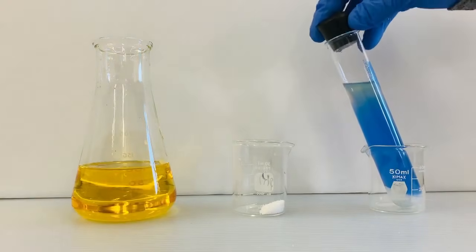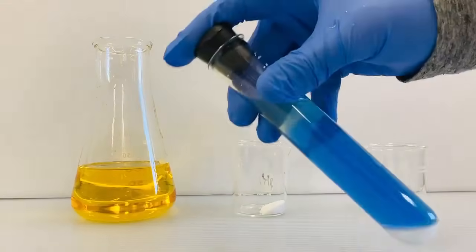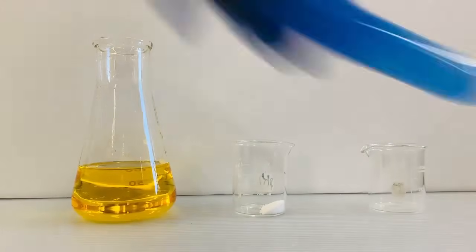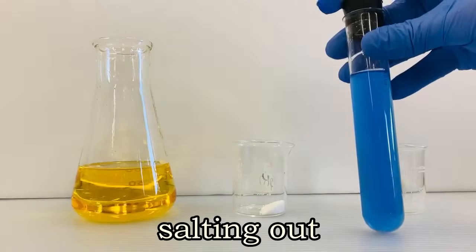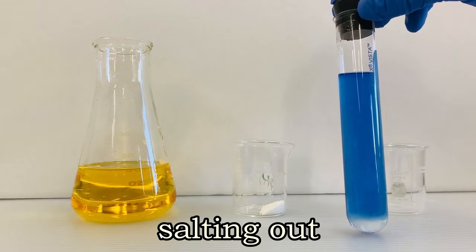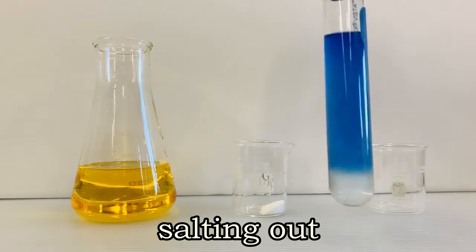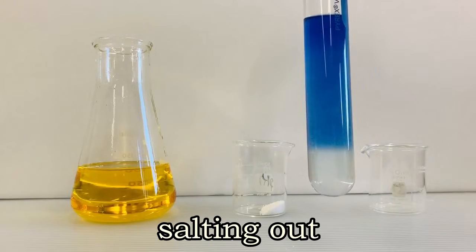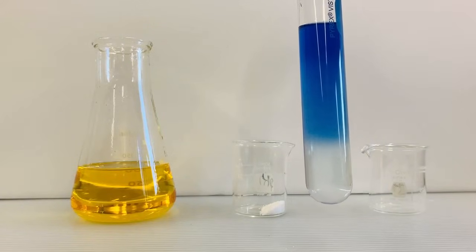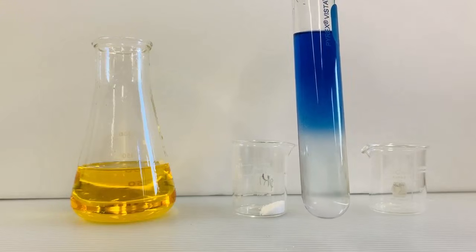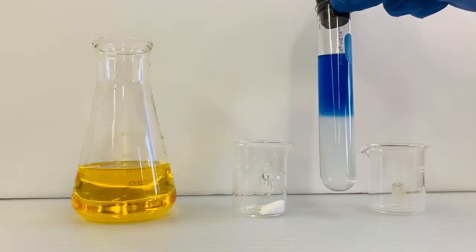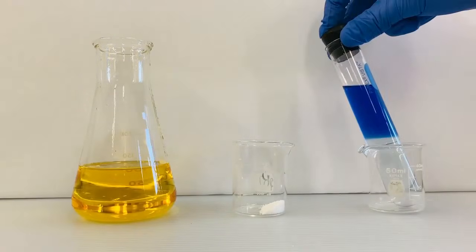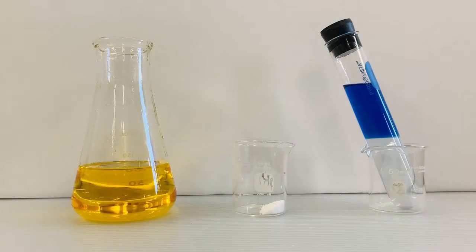What about the separation of the mixture into two layers of different colors after we add the basic salt? This occurs because of an effect known as salting out. This effect occurs when salt is added to a mixture of water and an organic liquid. The salting out effect causes the mixture to separate into two layers. The less dense alcohol layer ends up on top and the more dense salt and water end up on bottom. Because thymol blue dissolves in alcohol, but not the salty water, the top layer is blue and the bottom layer is colorless.